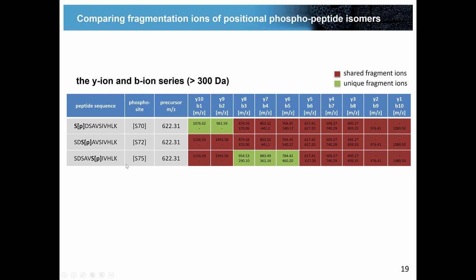So now you might think, oh, this is really bad, right? There's not a single unique transition for serine 72, so I will never ever be able to say for sure whether this peptide is present or not. And this is true if you would measure with SRM only a single transition per peptide, and there would not be a single transition that would be unique for serine 72.